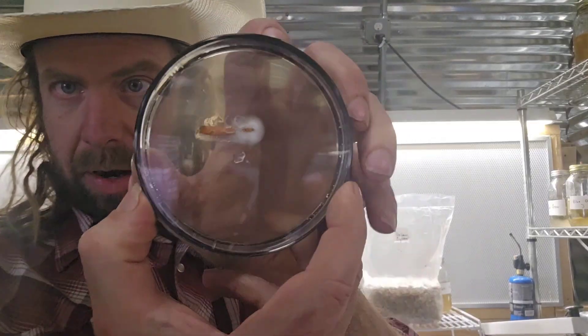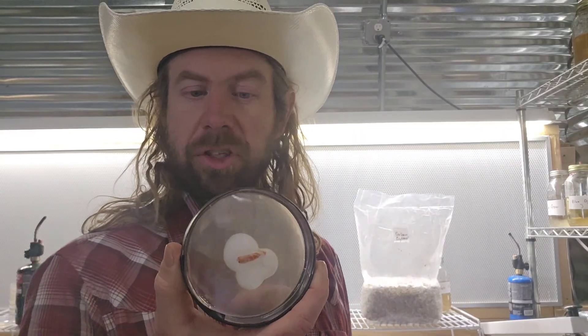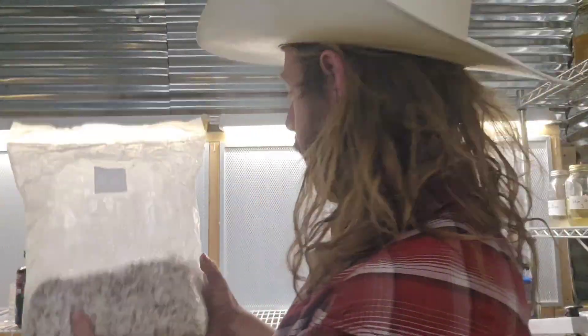We've got a lot of growth on the agar. I'm going to section some of that off, put some into liquid culture, put some into slants, and put some onto more agar — running a bunch of tests to see what happens with these multi asco spores. I'll get into single spore isolation in the future, but not just yet. I have a lot of things planned for the farm this next season and I'm really going to double down on gourmet cultivation — going to grow the most I've ever grown.